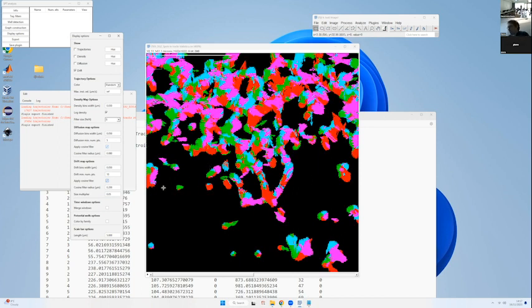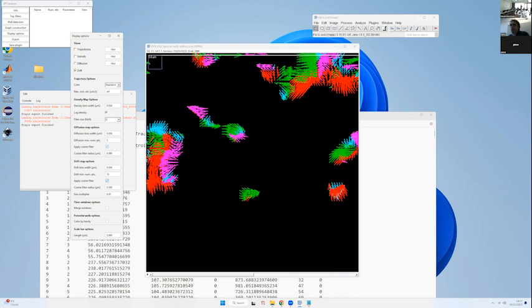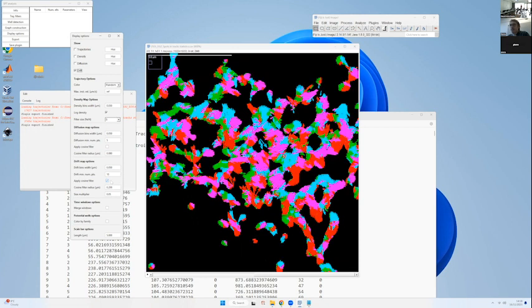So each color corresponds to one direction. So we have 4 directions: up, down, east, and west. Okay, so for example, when you have the 4 colors converging to one point, this is an interesting point where you can potentially have this high density region.